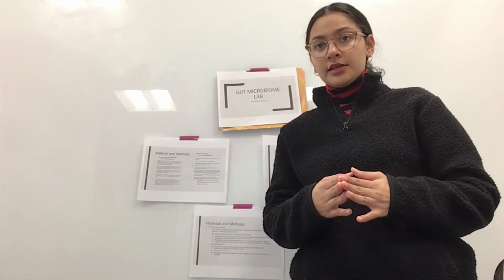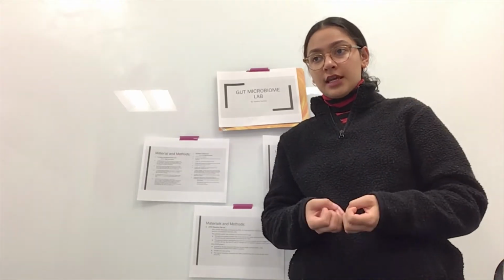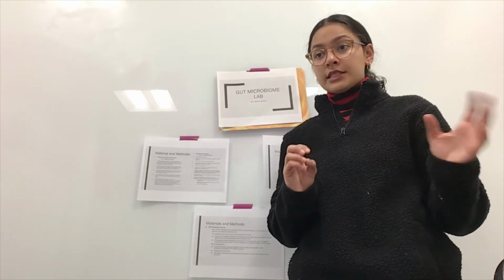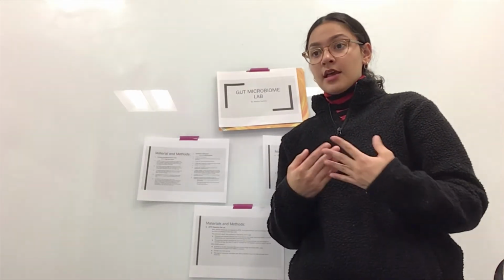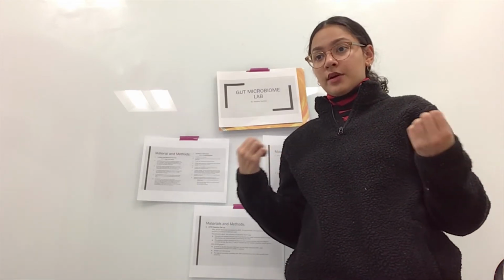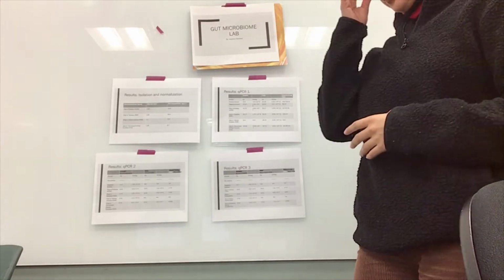There was also something present in the mix called SYBR Green. The reason is that it binds to double-stranded DNA, but not single-stranded DNA. Fluorescent light is emitted from the SYBR in the solution, and it's simple and cost-saving. The signal intensity correlates with the DNA amplified, and thus the initial sample input amounts. So that's how we know the initial sample that it started with. In doing so with the procedures, we did get results.